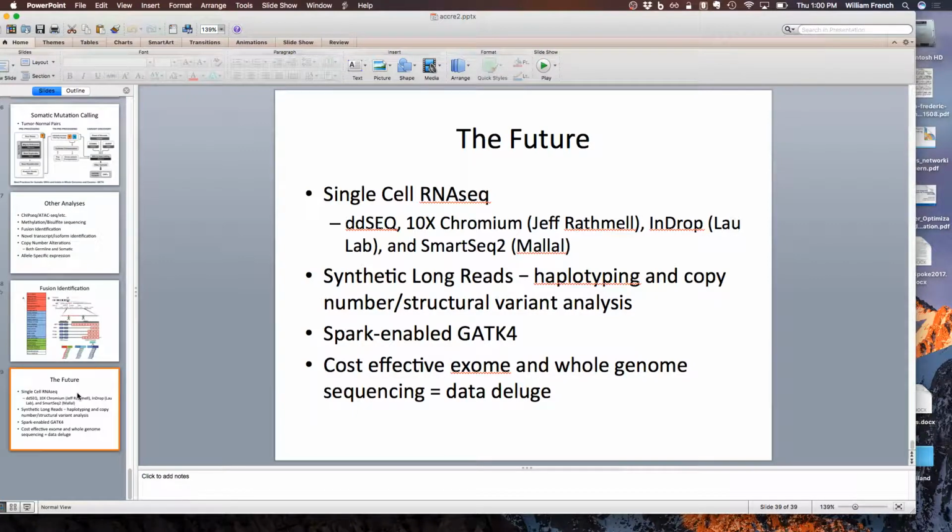In the early slide, you talk about QC for the reads, and you chop the adapter and the bad quality bases. How do you define the bad quality? So I use a quality score of 10 or less, 7 to 10. Usually, quality scores decrease over time, so it's usually the 3' end of a read that you're trimming, and that's also where you're looking for adapters as well.